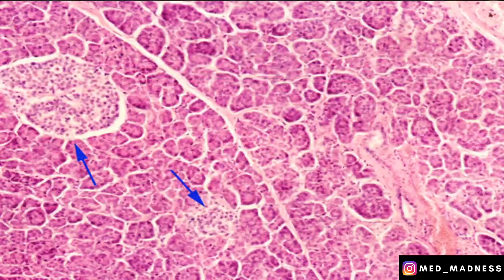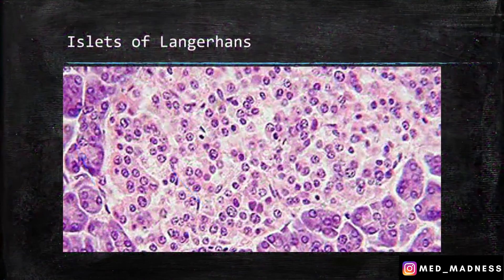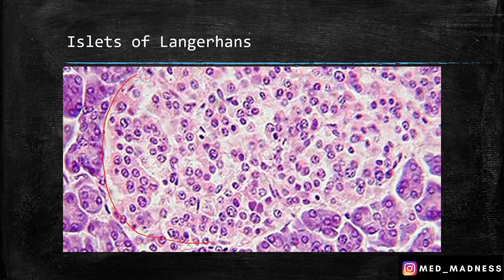Now we will see the histology slide — this is the pancreas. You can see the majority of the pancreatic gland is formed by the acini. The most distinguishing feature of the pancreas is the islet of Langerhans. This is the islet where you have different types of cells that secrete hormones. On higher magnification, you can see the islets of Langerhans very clearly surrounded by the acini.